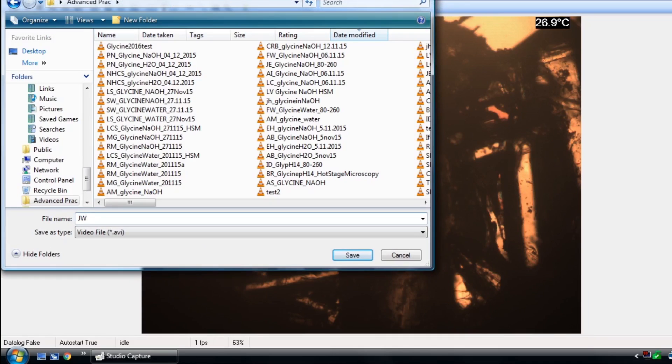Set your file name and directory. Make sure a temperature reading is visible in the top right hand corner.